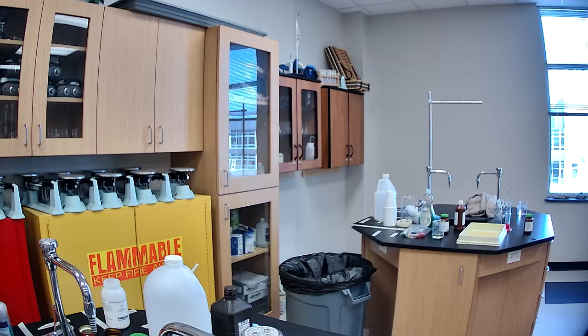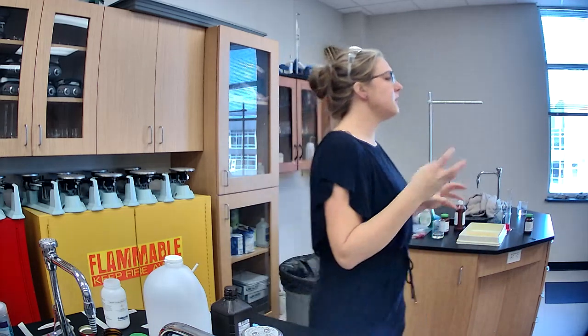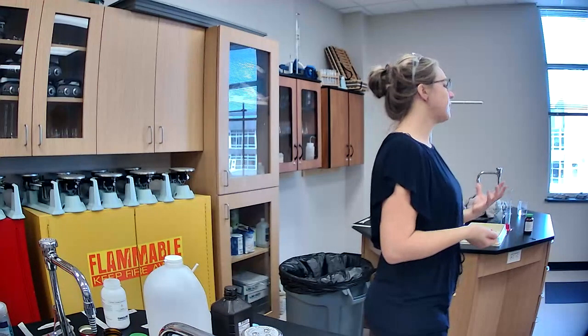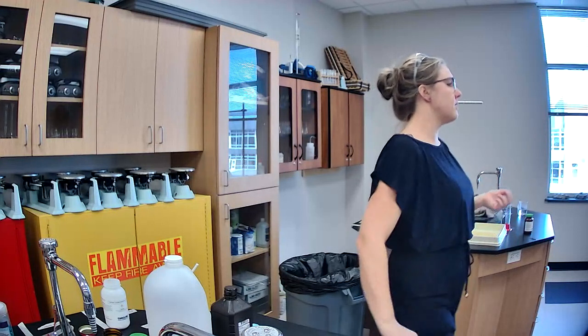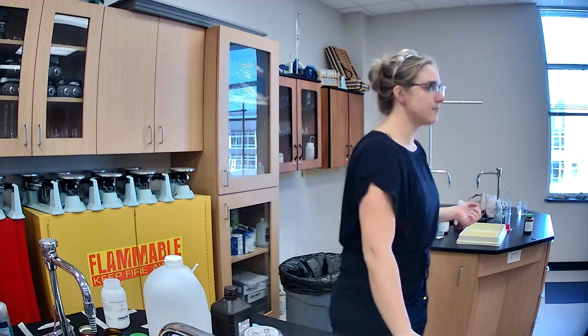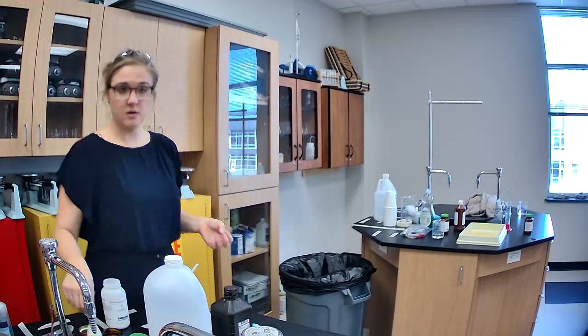So, that's experiment 2. The iron reacting with the water, the byproduct of that rusting reaction is heat. And you can obviously see the change in color there of the water turning more orange. Alright. Next one. I think I'm gonna make this blue color.